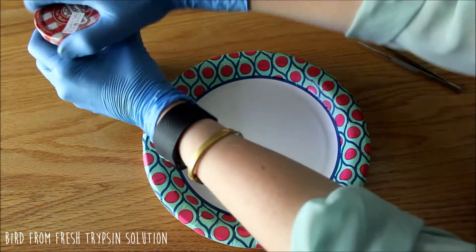Since this has been a fresh, new trypsin digestion solution for a few days, we're just going to take a look at what it looks like now. Let's go.